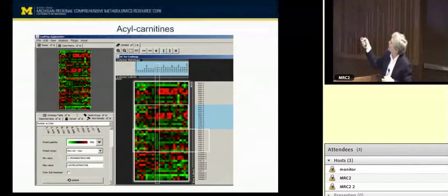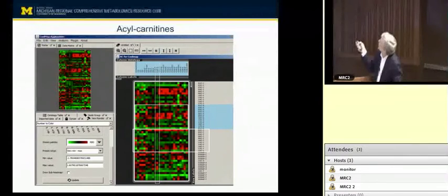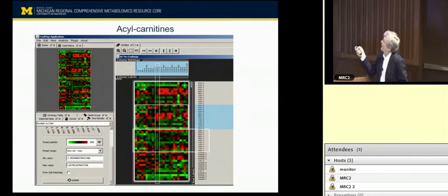What I show you here is that these are the control individuals at baseline, and at 1, 4, and 7 days of the polyunsaturated fat diet. You can see 10-1 tends to go down. So here's baseline, this carbohydrate diet, I apologize. So it's down, goes up after the polyunsaturated fat diet, then goes down again.